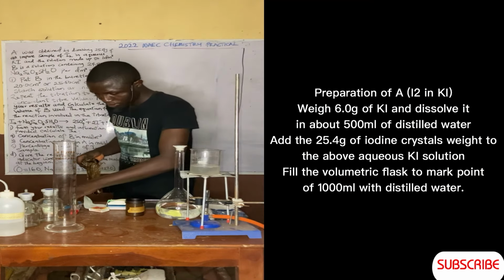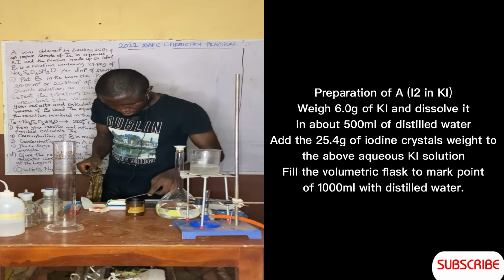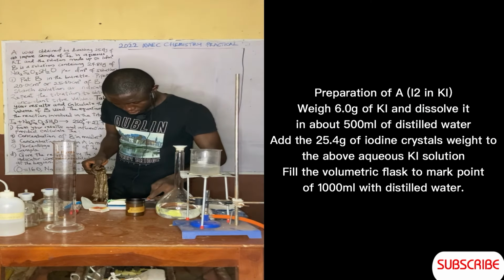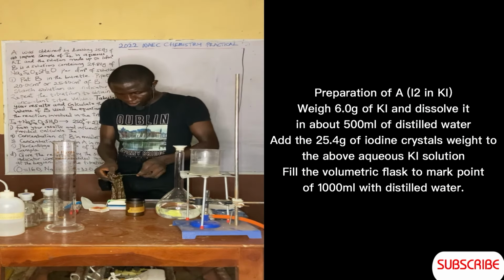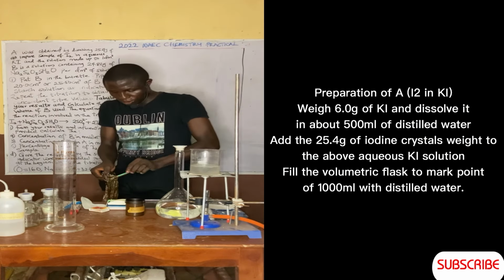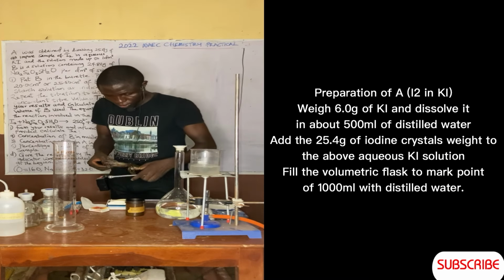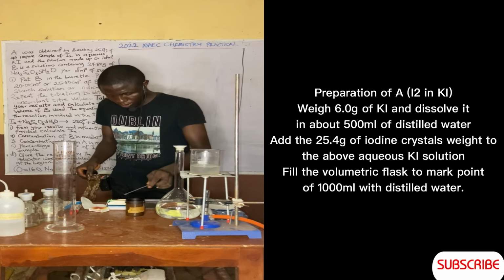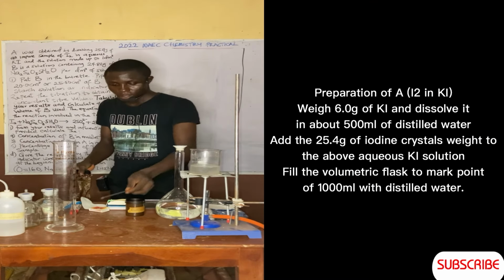25.4. I have to put this. So this is 25.4. You can reduce it a little bit.